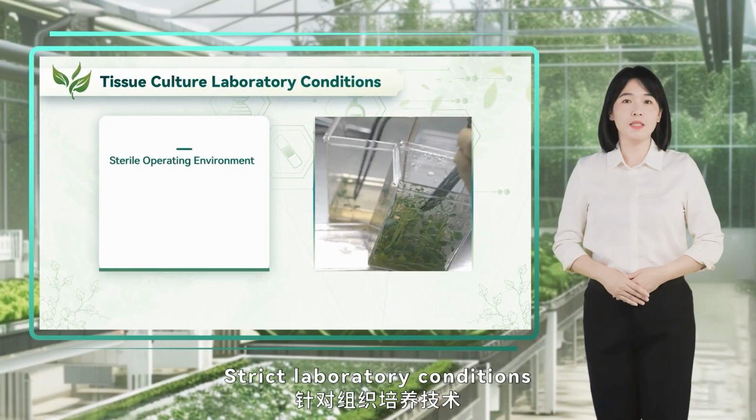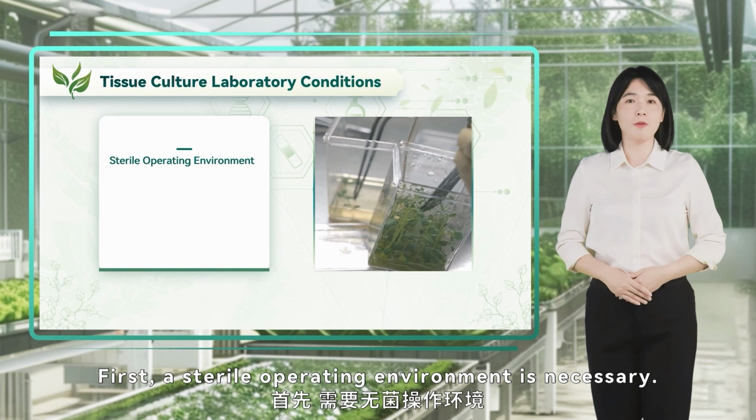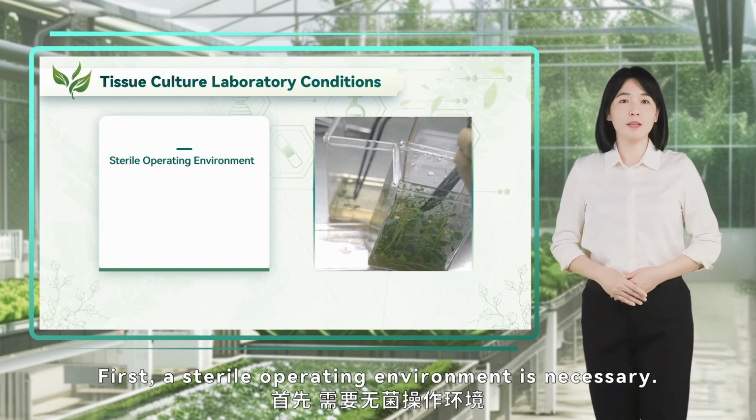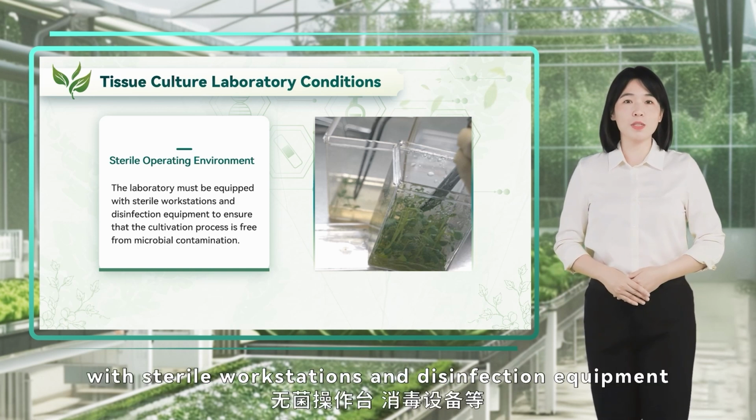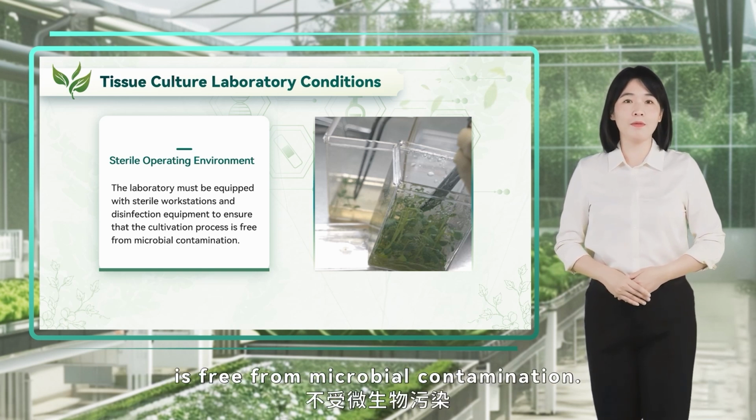Strict laboratory conditions are essential for tissue culture technology. First, a sterile operating environment is necessary. The laboratory must be equipped with sterile workstations and disinfection equipment to ensure that the cultivation process is free from microbial contamination.